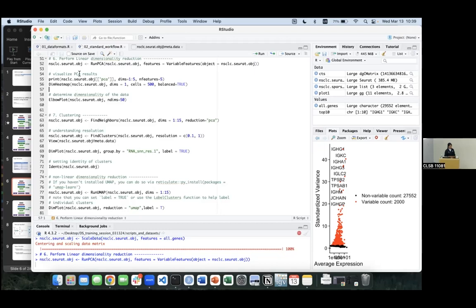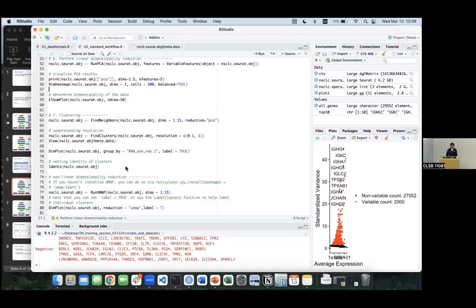So after you have your PCA results, you can use, oh, I have chat here. Yeah, and it does have a high computing cluster. My main language is Python, so I kind of use it. Are you inside Dana-Farber? If you're inside Dana-Farber, I believe you can use it. If you have a high computing cluster, it'll definitely be faster for you.